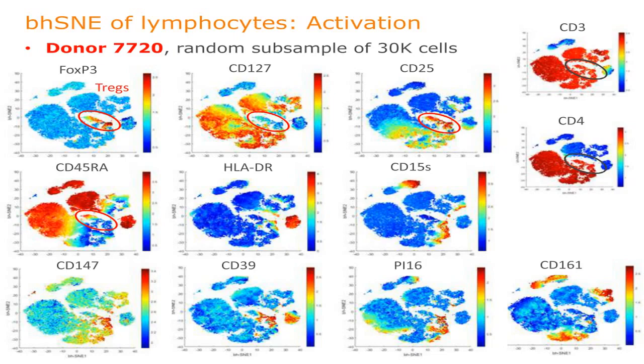You can see that there's a continuum of expression across the larger CD4 group. So I'm now looking at the CD45RA plot. And you can see that there's a continuum of CD45RA expression, which we expect on all CD4 T cells. You also see the same pattern across the CD4 negative cells, which is actually probably our CD8 T cells, but I don't have a CD8 marker to tell me that. And I see the same continuum across the T regulatory cells. All right?